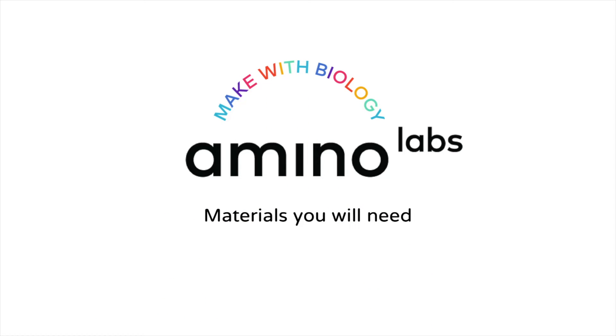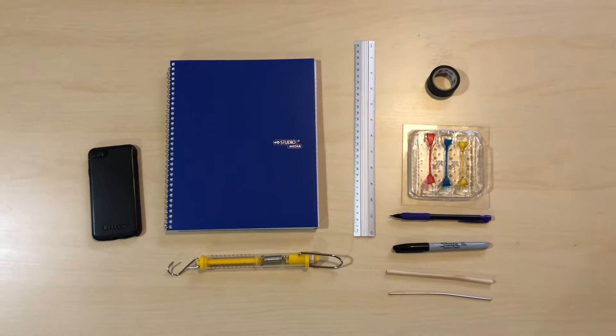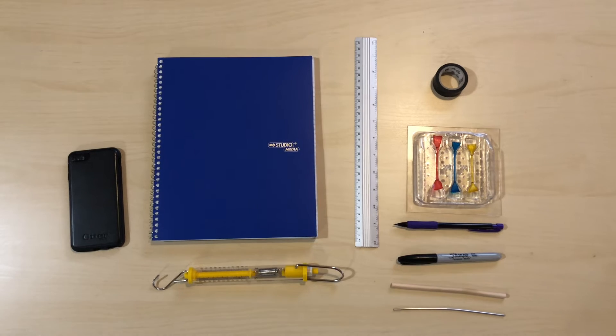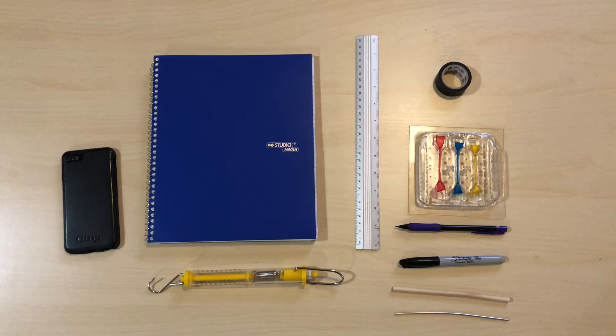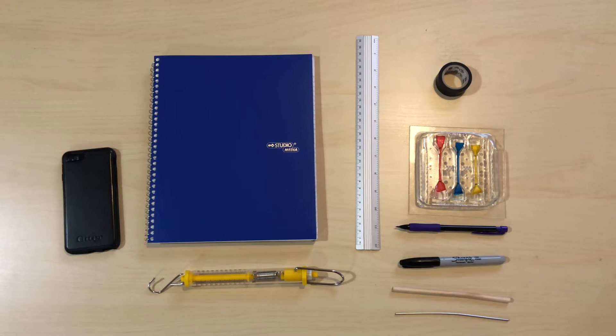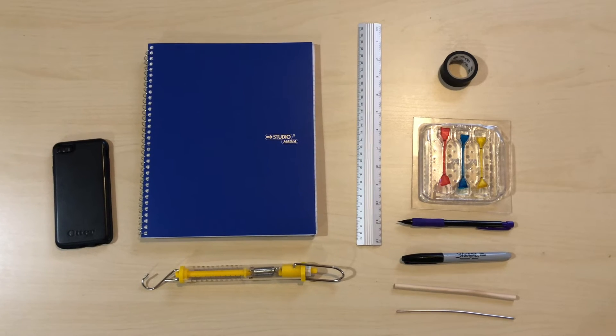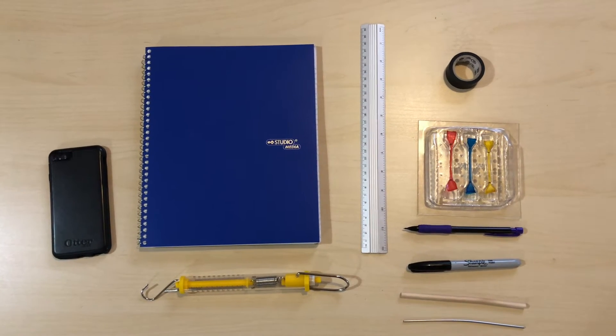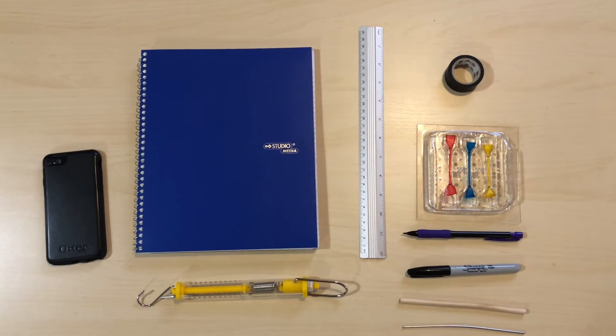You will need a phone, a notebook, a force meter that measures kilograms or newtons, a ruler, tape, a marker, a thin metal rod or dowel, and your molds with the three dumbbell bioplastics. They are not shown here but you will also need a computer, a partner, and two desks or tables.